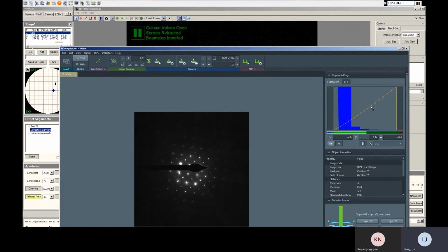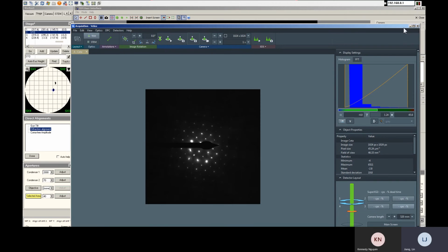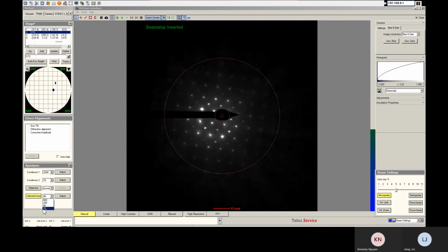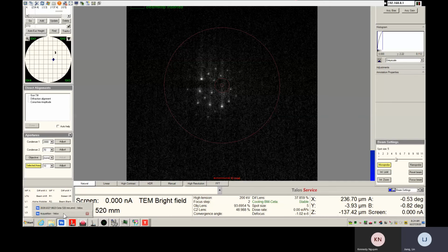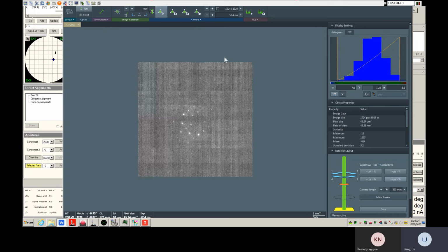After you get the imaging, you can do some filtering to make the image look nicer. And then we can go smallest one, 10. This is smallest one, 10. And you leave the screen. Quick look application, you go preview.